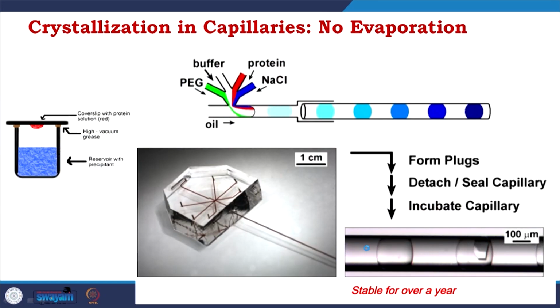Now when you look at crystallization in capillaries, you get another advantage. Remember I talked about sitting drop or hanging drop, where you got crystals, but equilibrium is not reached.